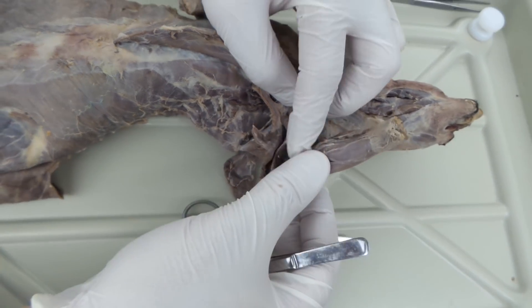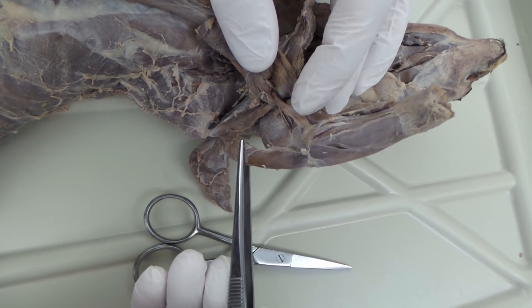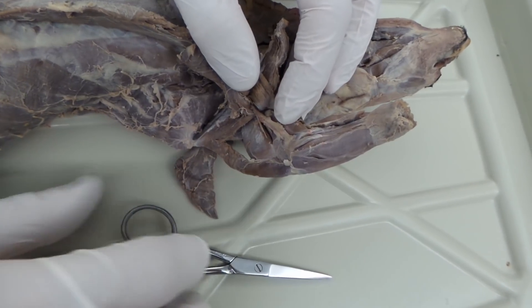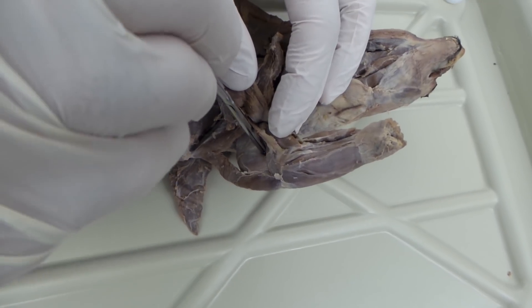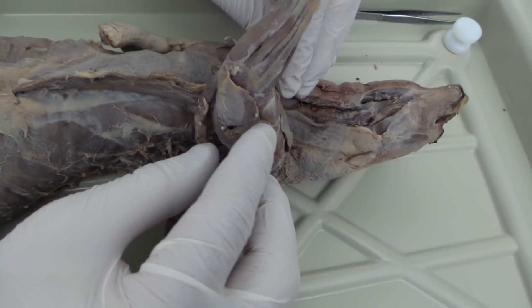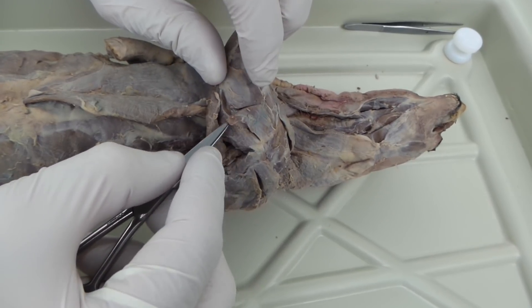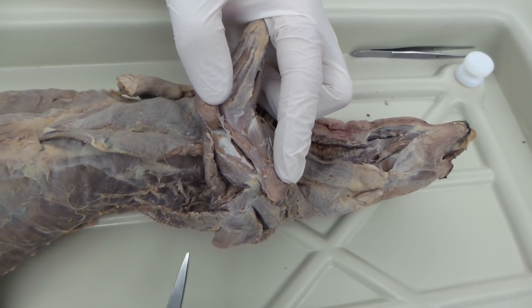Now if we work over to the arm and pull things down, you're looking at the epitrochlearis — dorsal epitrochlearis. On the key it's just epitrochlearis. And then we can see the triceps. We have triceps long head. You're going to want to take that triceps long head and work down to isolate it from the triceps lateral head. Cut through the belly of that muscle. So again, long head, lateral head of the triceps. And then below that you can see the medial head — hence triceps, three different muscles.